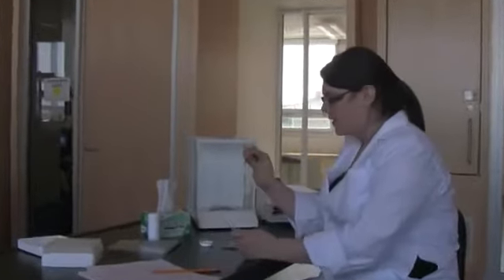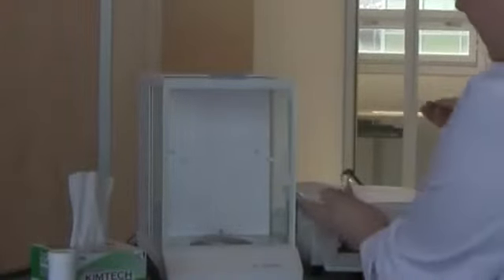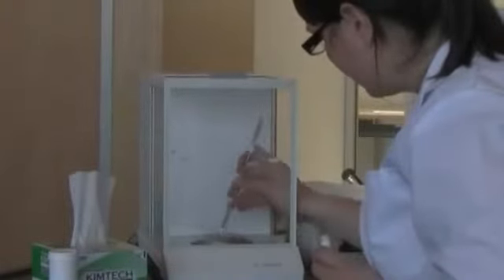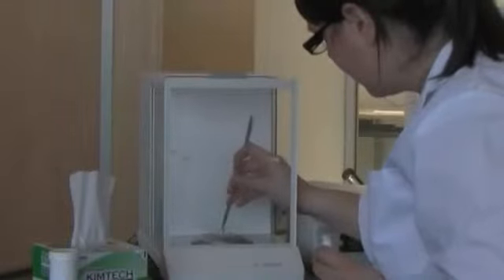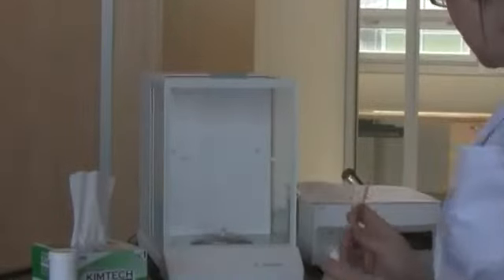Using your tweezers, pick up a tiny tin capsule, place it onto the microbalance, and tare it so that your balance records 0. Using a small scoopula, pick up a small amount of ground tissue and place it inside the tin capsule. Here you're looking for a target weight of 0.5 milligrams to 1 milligram of ground tissue.